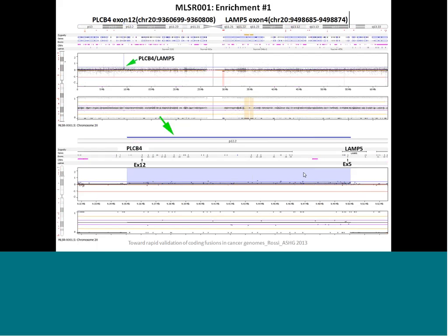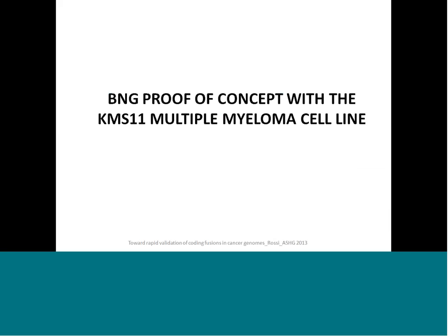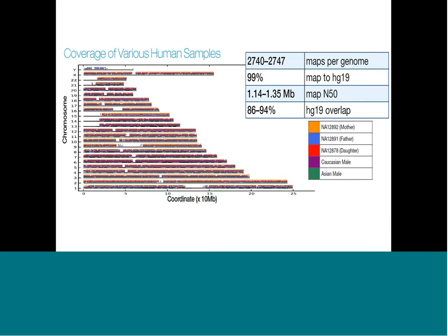And so it often requires getting in normal DNA, going through multiple changes. So we're really trying to look for technologies that summarize everything, and I think that's really where BioNano Genomics comes in. We approached BioNano Genomics with this proof of concept experiment where we took a very well characterized multiple myeloma cell line, KMS11, and we allowed them to run their technology to fully characterize what was happening. And as Harper went over, the resolution of this technology is really to be able to see structural rearrangements at a larger contig level.